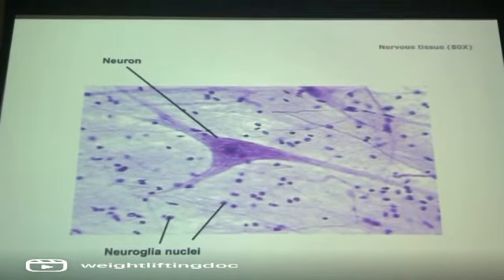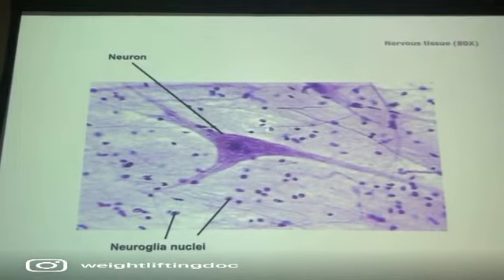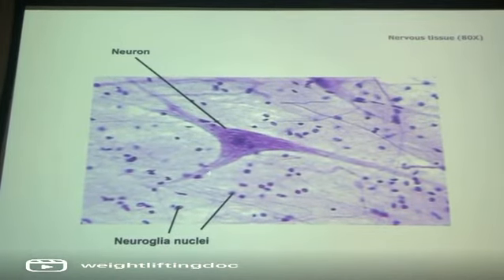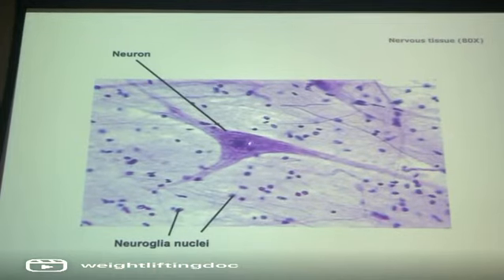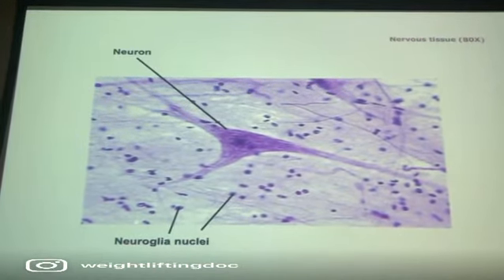And this is a neuron. Well, actually, we're going to say this. If I say what's a tissue, you're going to say it's nervous tissue, right? Because different cells in here. This big purple guy in the middle, this is the giant multipolar neuron. You could just say neuron. And then these little guys here, all these little guys are helper cells. They're called neuroglia. So two different types, or two categories. This is a category of cell, neuroglia. This is a neuron, and then the tissue would be nervous tissue. Depending on what's asked, pay attention to that as well.